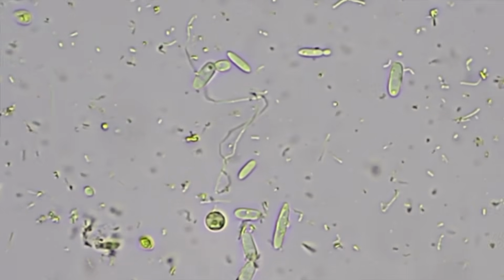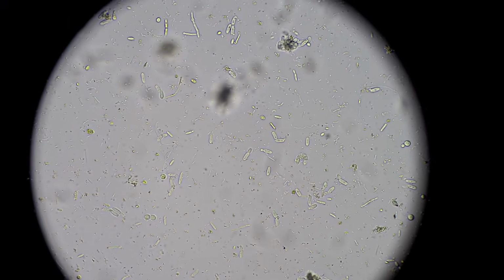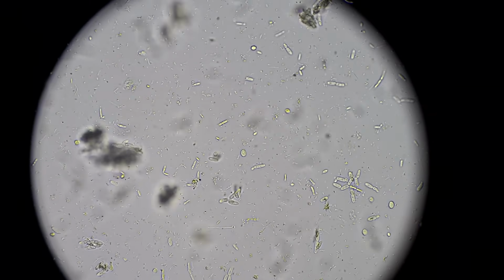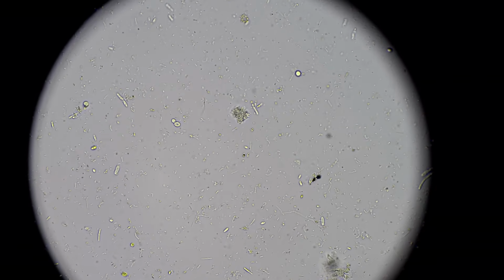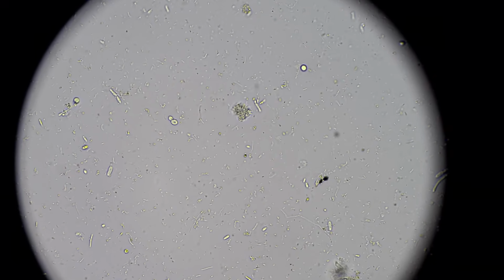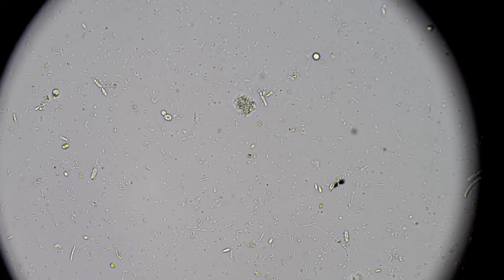So everything's happy. Everything's going and growing, but it's not feverish, the activity. There's a hustle and bustle, but there's not mobbing. I mean, there's colonies forming, but they're not mobbing on food sources. There's a lot of microbes interacting with each other. What they're doing is they're exchanging DNA. They're also sometimes consuming each other or bombarding each other with different things so that they release DNA or they release nutrients to each other.